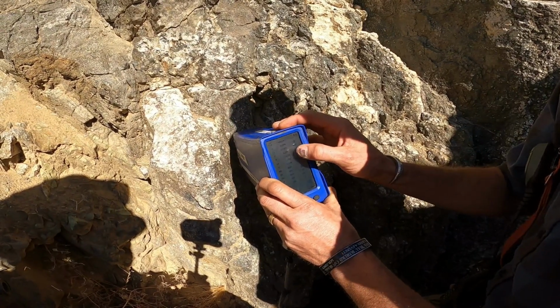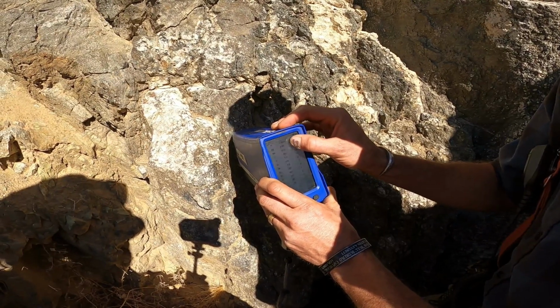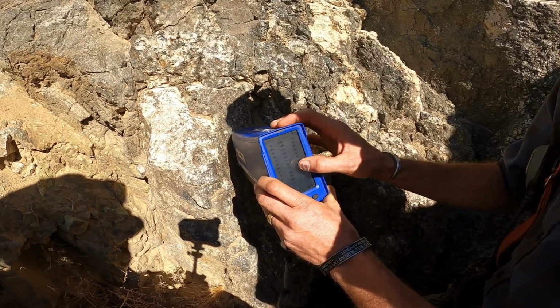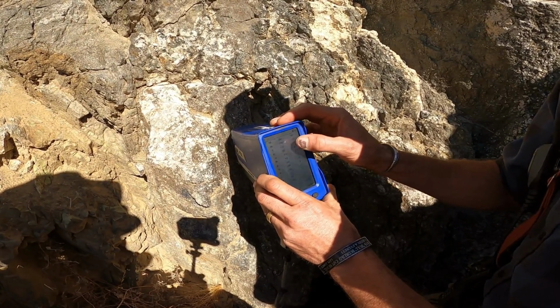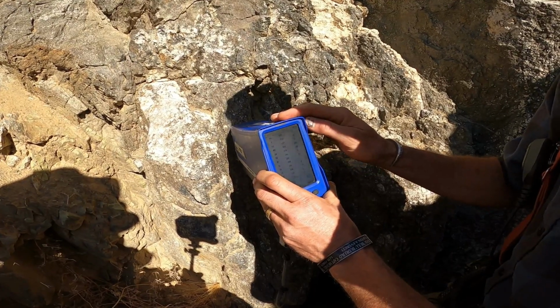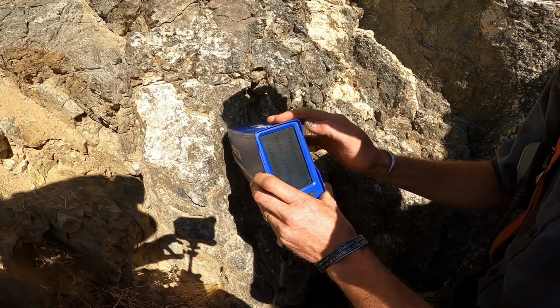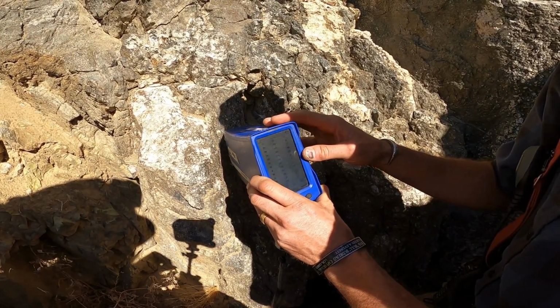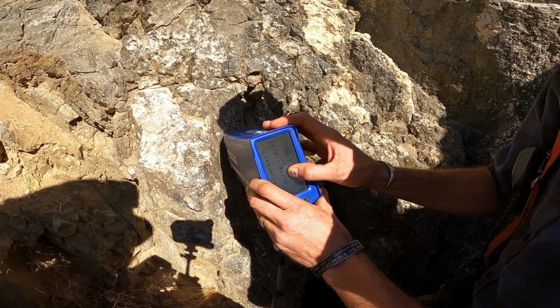Yeah, so even the potassium out this far is still going. Yttrium is at 500. It picked up the lanthanum, just under 500. Yeah, okay, lanthanum. It seems like the neodymium is hanging up more towards, yeah, see there it is. There's the neodymium. Well, 470, it's still bouncing around. 520. Yeah, climbing.